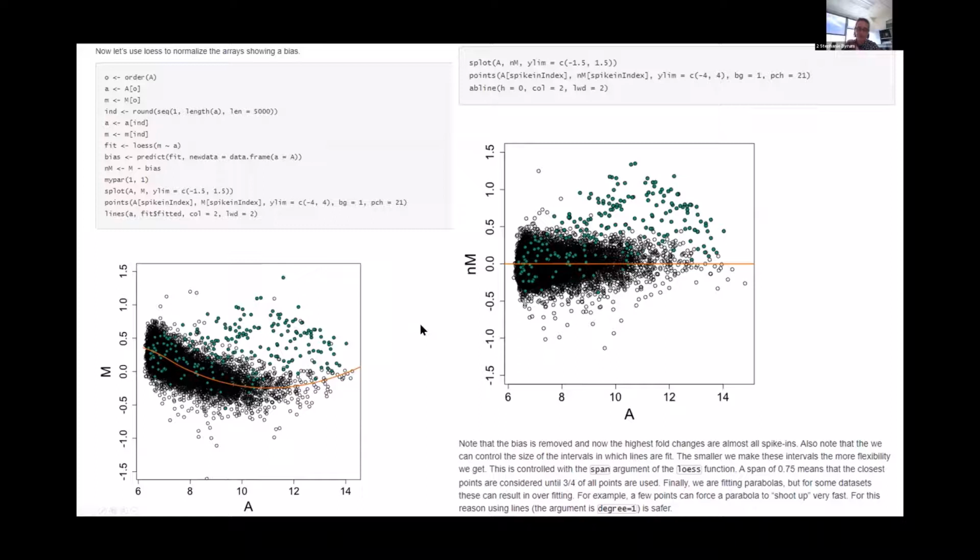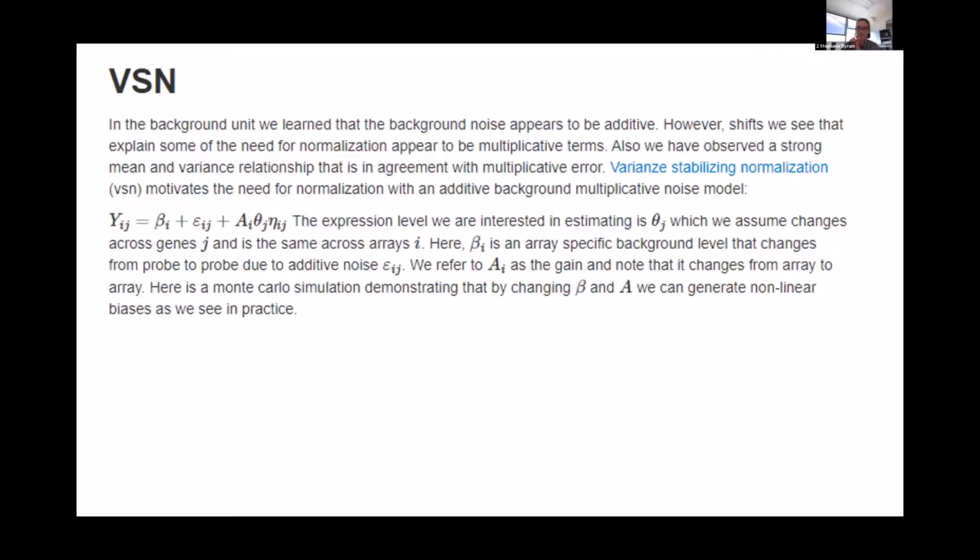So it's cyclically applying a linear function onto a curved graph and flattening that out. Other people could probably explain these algorithms a lot better than I can, especially right now, but there it is.